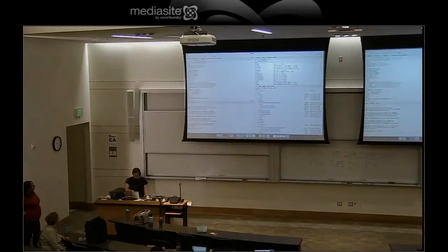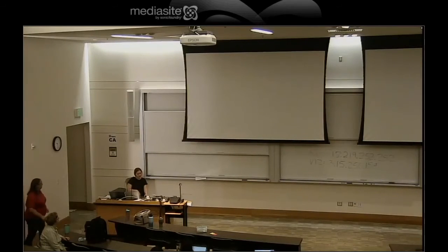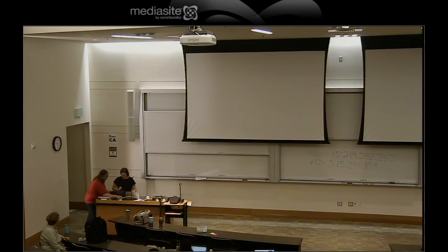The only other thing that you really need to know to be able to run this script, and like I said, there are a lot of instructions on this script for you to keep for whenever you want to run R in the future, for reminders. If you hit Control Enter, that's how you actually run a line in RStudio. For example, I don't know if I can run any of Mary's lines. It's not going to work.